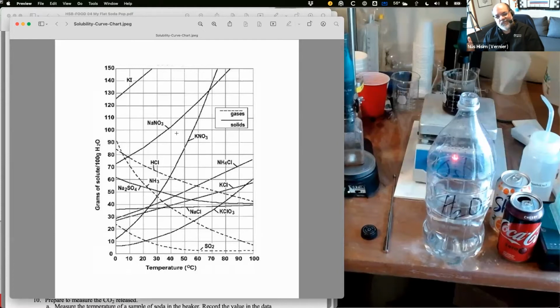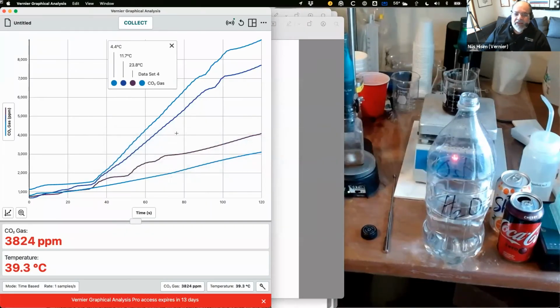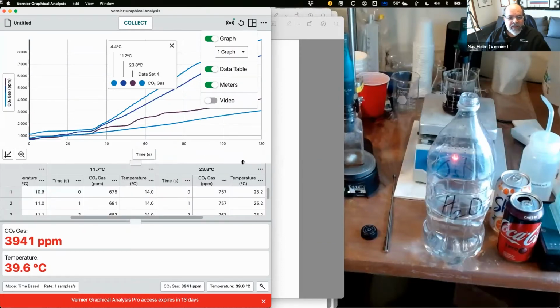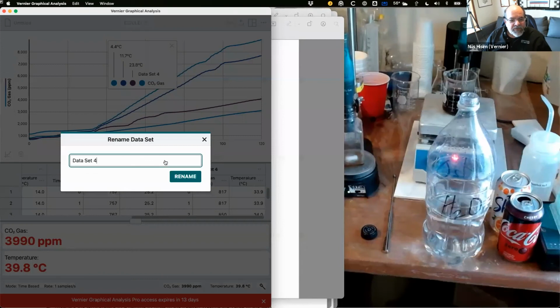And so this is what we talk about all the time. Oh, I bet my run is done. Oh, there we go. But let's look at this one. After we're done with this, let's look at this one and see how it goes. Let me go ahead and rename that last one. And then what we'll do is we'll go ahead and transfer the data. If you've already done it, that's great. If not, you may not have the max values yet. Let me type that in. That was 33 degrees.